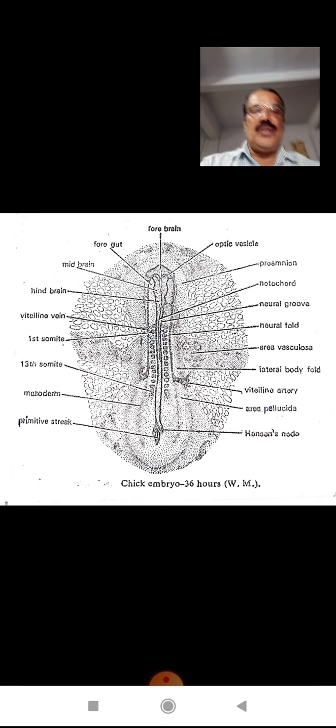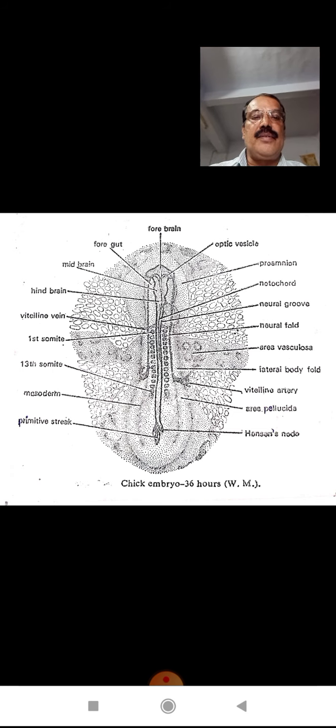This is something about a whole mount of 36 hours chick embryo.